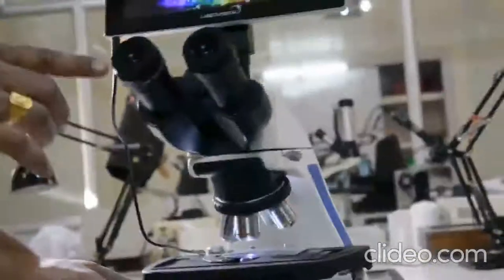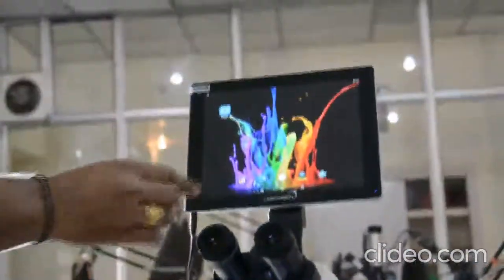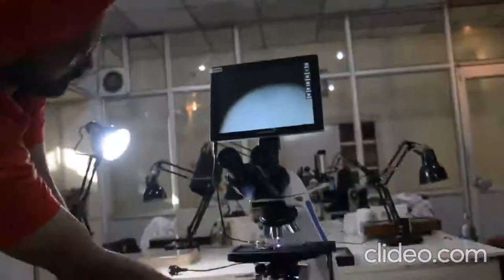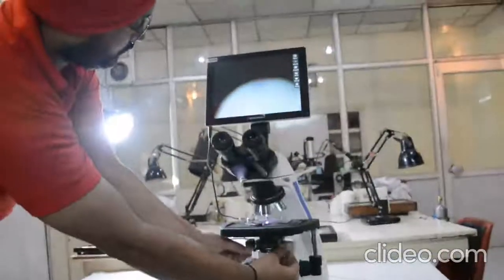We will put this out of focus. We are adjusting the illumination along with the condenser.